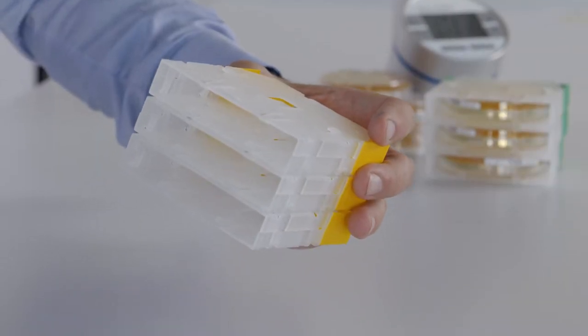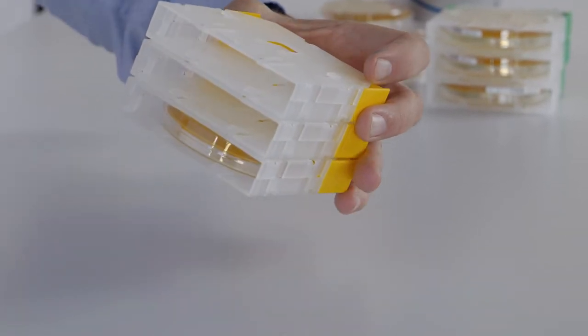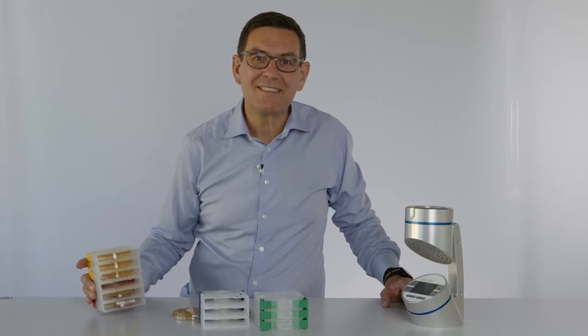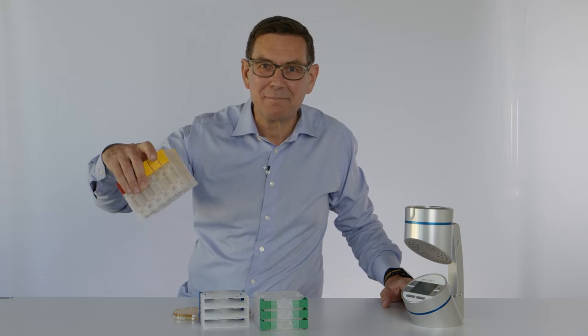It's very simple to place the media plate into the dispenser. Once in the PSD, the plates will stay safely in place.